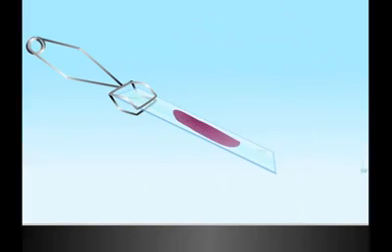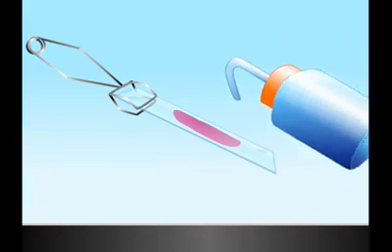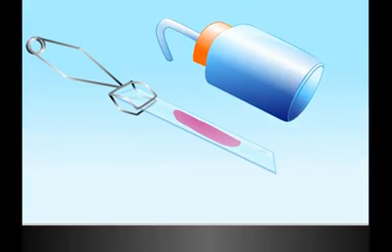The cells are then decolorized by washing with ethanol or acetone. This is the differential step. Gram-positive bacteria retain the crystal violet, whereas gram-negative bacteria do not. The ethanol or acetone should be added drop-wise, with the slide tilted at an angle, until the drop coming off the edge of the slide just starts to become colorless. Even gram-positive cells can lose the crystal violet iodine complex during prolonged, excessive decoloration.